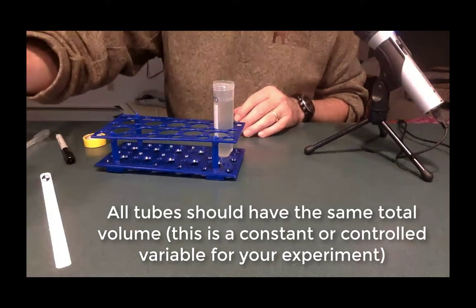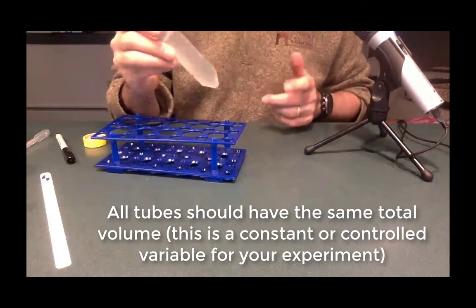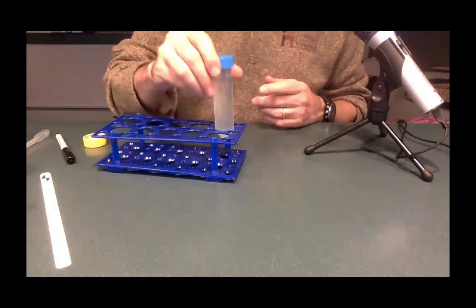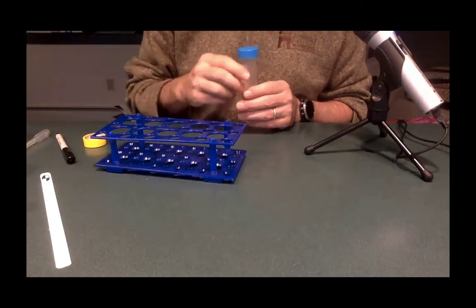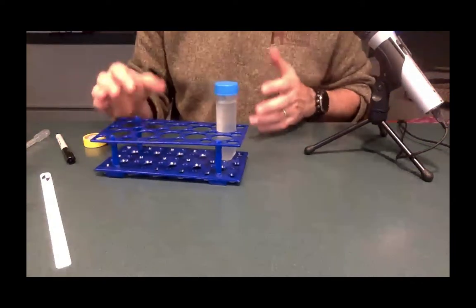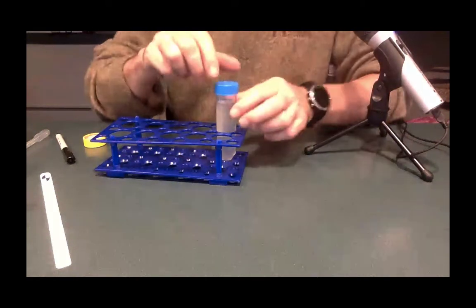In this particular case, I have set a total volume that I've decided for myself. All of my tubes, regardless of whether they're test or experiment or what, should have the same amount in them, right? So now what I've done is I've got my tube, and again, this would have a label on it, and if this is my experimental tube, I would do multiple replicates of this. So I would have at least 3 tubes like this, maybe as many as 5 tubes that are set up like this, but I have multiple of these so that when I collect my data, I'm not just getting a single data point on this.